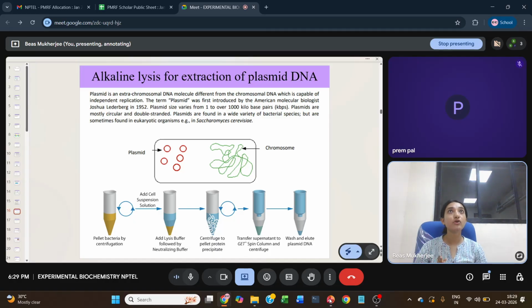They can be used for production of some kind of toxin. So there can be different kinds of plasmids which are mediating different kinds of resistance properties and production of a specific substance. So all of these different things are assisted by plasmids, and that is why the bacteria carries them. Okay, now see, so the pelleted bacteria comes, you have the pellet, you have the supernatant.